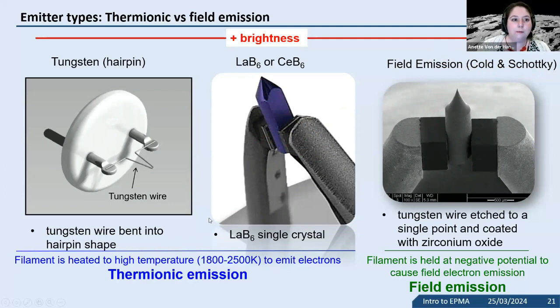So it's a field emission type of cathode that is also being heated. Okay, so how do they differ? The tungsten type filament is probably the most common and still very popular. It gives us the poorest spatial resolution because it's relatively difficult to focus the electrons that we generate at a relatively broad tip all the way down to the sample. And for a lot of materials, specifically in the earth sciences, that may not necessarily be a problem because super high resolution is not needed.